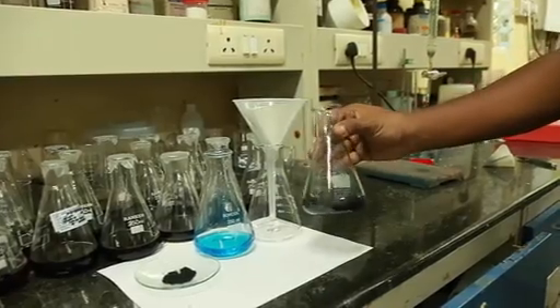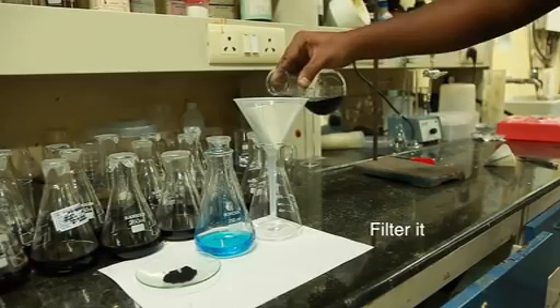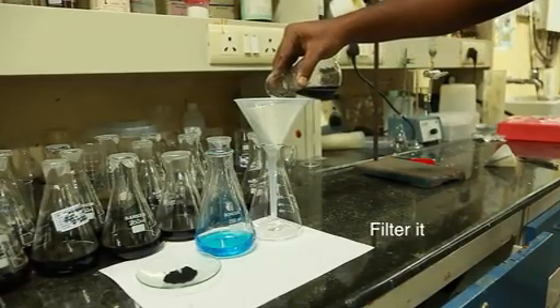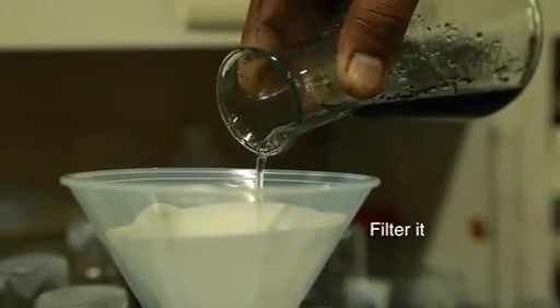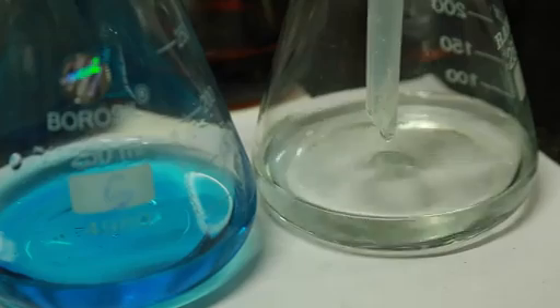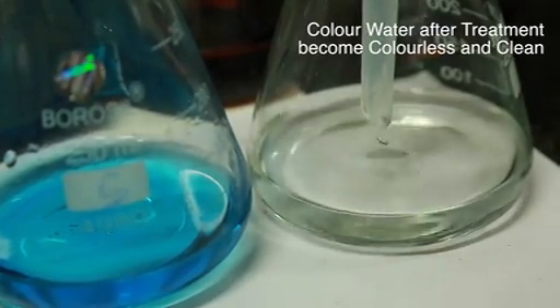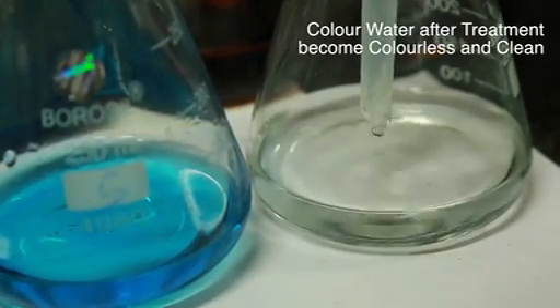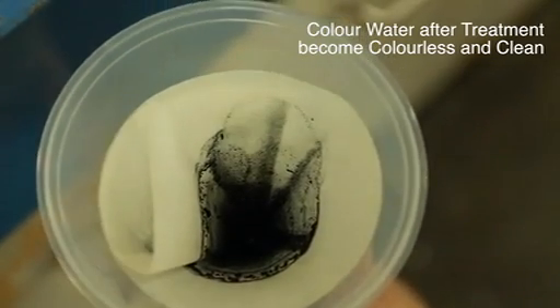Now I am filtering it. Here you can see the filtrate is coming out completely clean, transparent, and colourless. This is the way how jute stick activated carbon can be used to clean effluents.